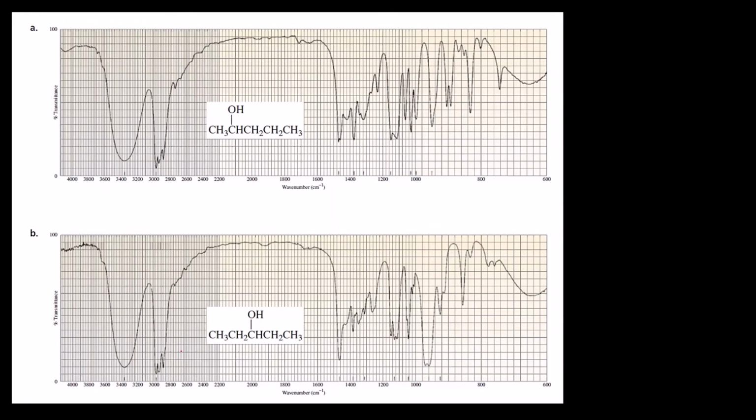You can see here there are two different molecules. This is 1, 2, 3, 4, 5: pentan-2-ol. Pent means a 5 carbon chain, at the second position there is an alcohol. And this is pentan-3-ol, or 3-pentanol. These are position isomers, because the position of the functional group is different.